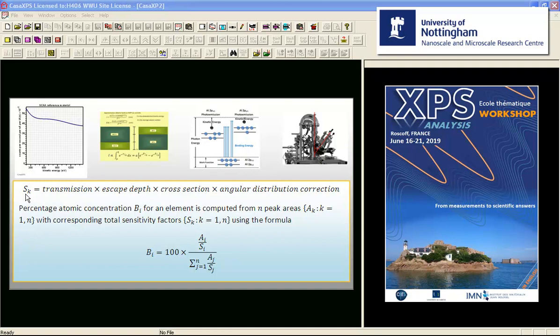However, if we know the relationship between this instrument in terms of its response and other instruments, then a relative transmission function can be calculated which would allow you to correct these sensitivity factors so other instruments measuring spectra can have these spectra corrected to match the characteristics of the instrument that measured the standard materials. Therefore, these total sensitivity factors can be included in a calculation provided we also include a relative transmission function. And this is exactly what Kratos do.